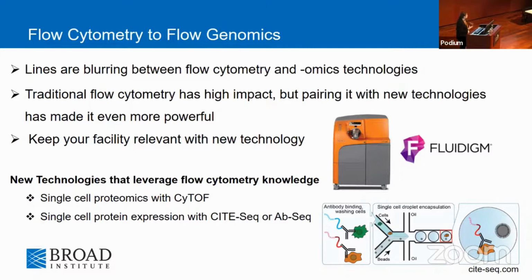A lot of times you might be saying, oh, you're going to phase out flow cytometry, and that's not the case, because all of these new technologies still need to be backed up by something that's been tested and tried in the field, right? A lot of the reviewers are going to say, go back and do that experiment the regular way and show me that it actually makes sense. And so I don't think we're going to phase ourselves out by doing this anytime soon.